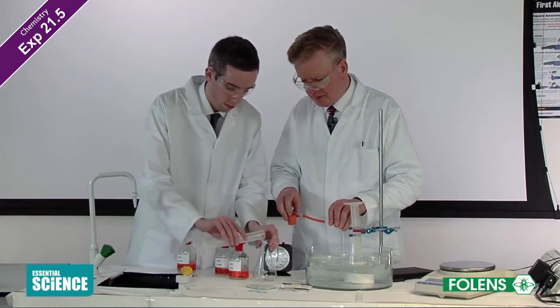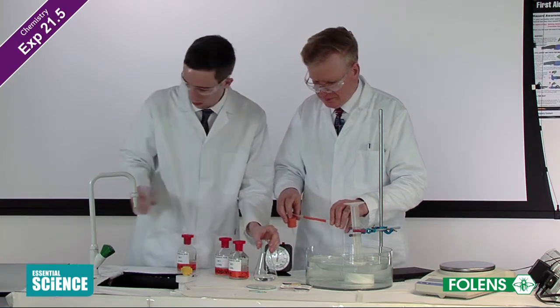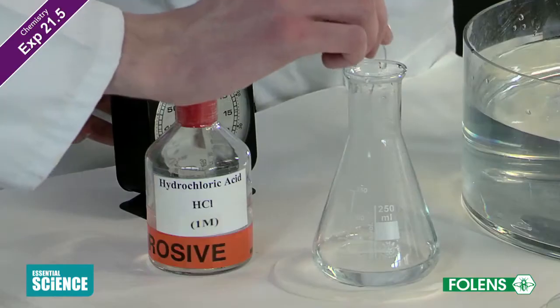Repeat the experiment using the same mass of magnesium metal but use 1 molar hydrochloric acid. That is, use acid having twice the concentration of the original acid.